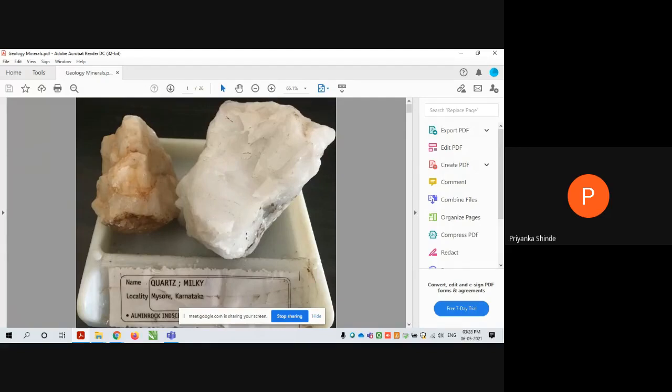The quartz is on number 7 of the hardness scale, whose hardness is more than the streak plate. In such a case, if you rub the mineral on the streak plate, you will not get the color of the mineral powder because it is not getting powdered, because it is harder than the streak plate. So that time we can write it as absent. For all the quartz varieties, the streak is absent because of its hardness.